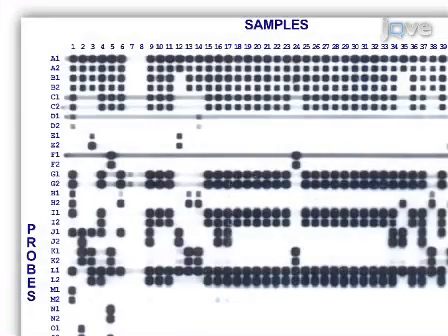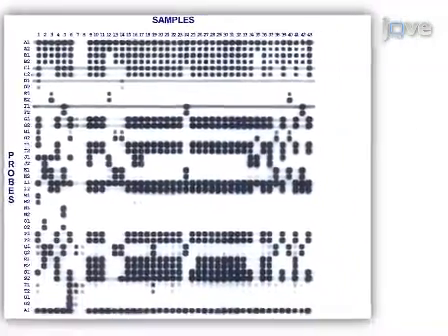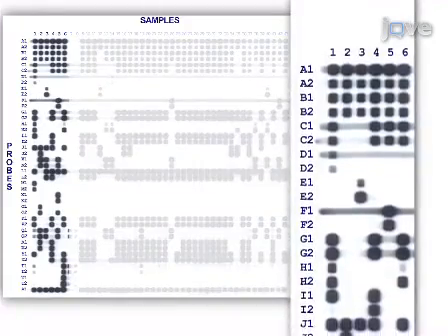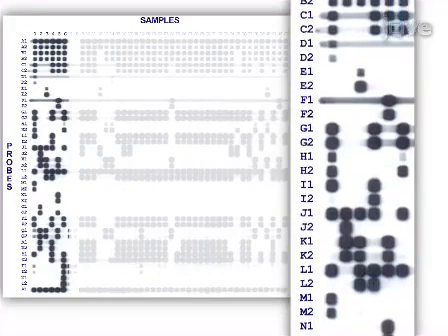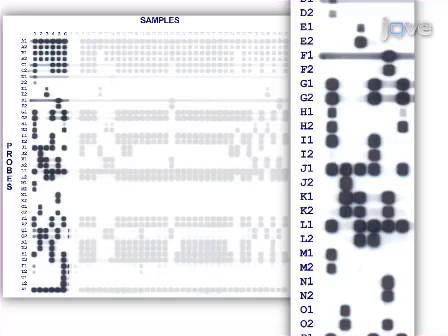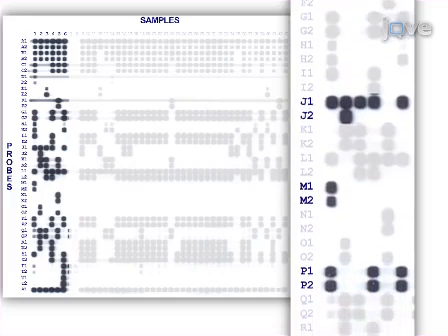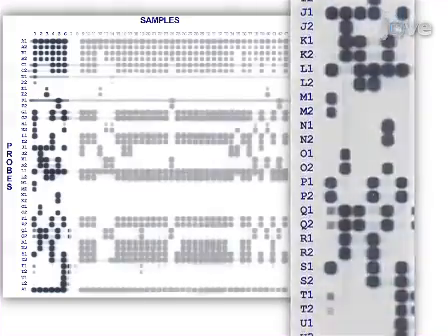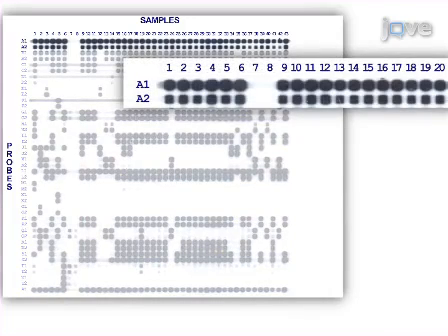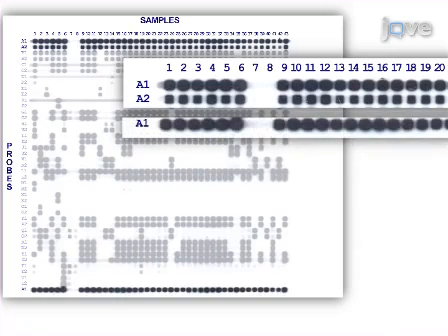This figure shows the results from a multiplex PCR reverse line blot hybridisation assay. Samples 1 through 6 represent positive controls; between them there is at least one positive probe signal for each of the 43 probes. Each target sequence, A through U, is detected with two different probes to maximise specificity. Probes A1 and A2 represent species-specific probes, which are expected to be positive for each sample and assist with orienting the film. Probe A1 is repeated at the bottom of the membrane.